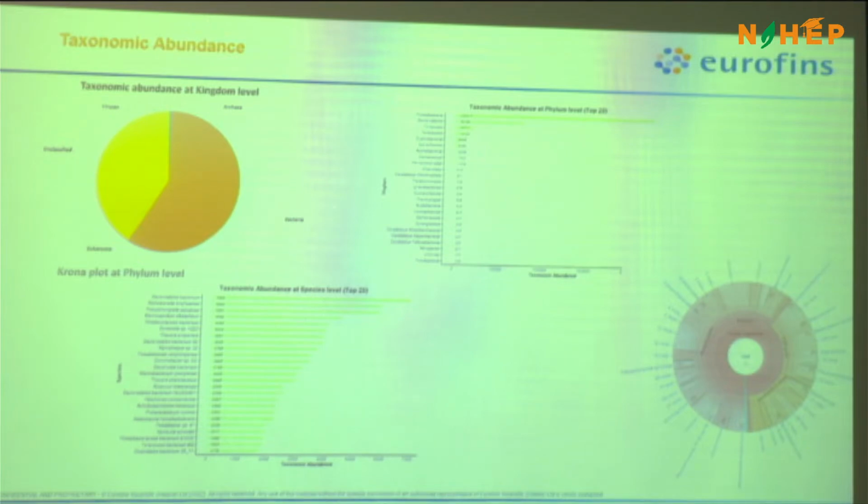But when we are doing 16S, we are only targeting bacteria, and we talk about abundance only of our bacteria and the rest of the things. Again, the Krona plot is one more representation where we can have an interactive phase, see different levels with an interactive graph.